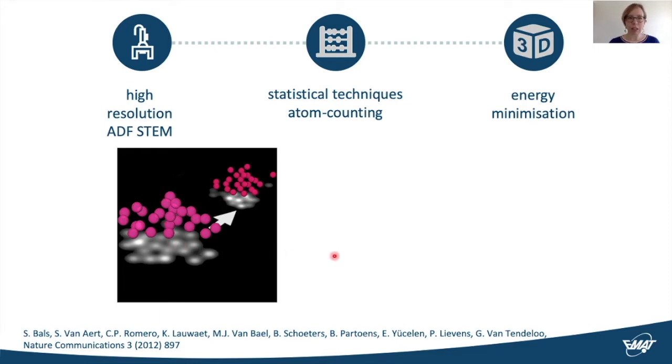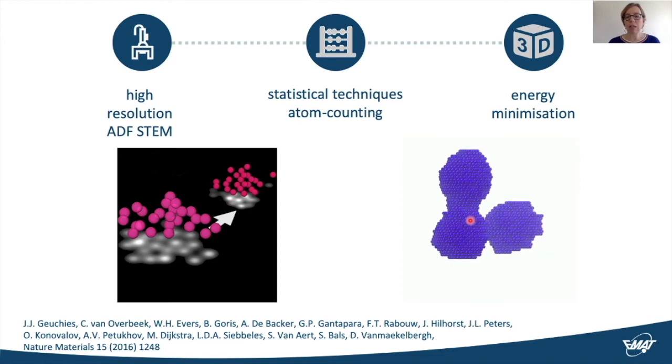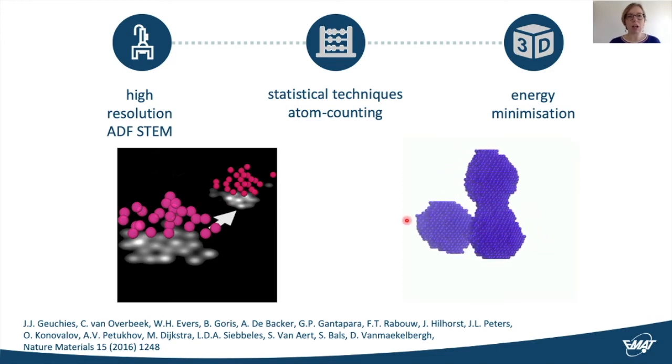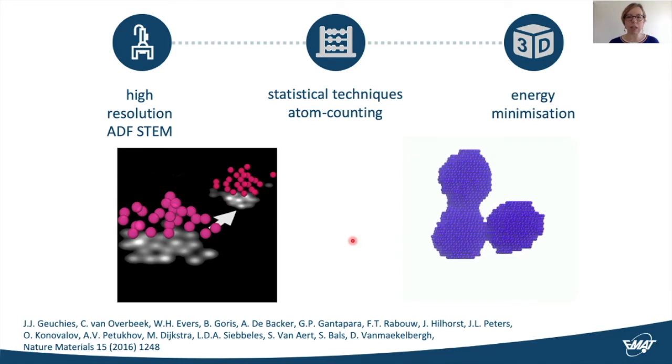When investigating larger structures, such as this superstructure, which is formed by lead selenide quantum dots, a similar methodology can be used, where instead of ab initio calculations, a Monte Carlo approach for minimizing the total energy of the structure is used to determine this 3D atomic structure.